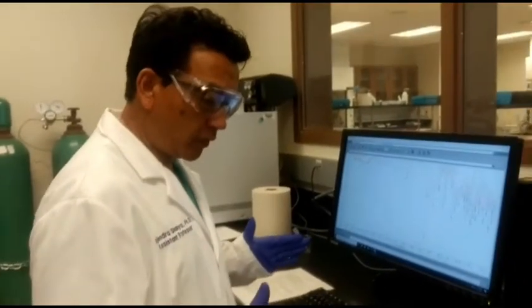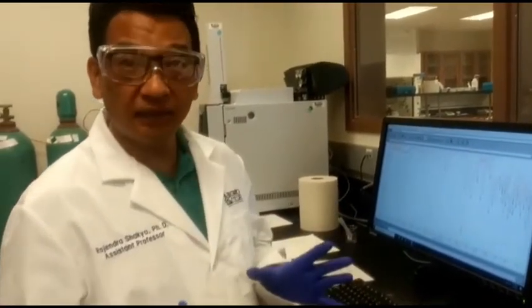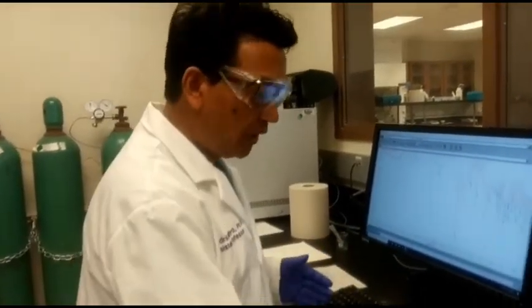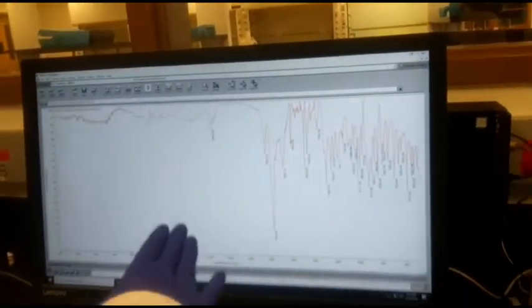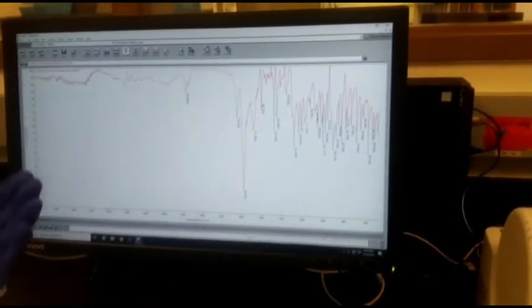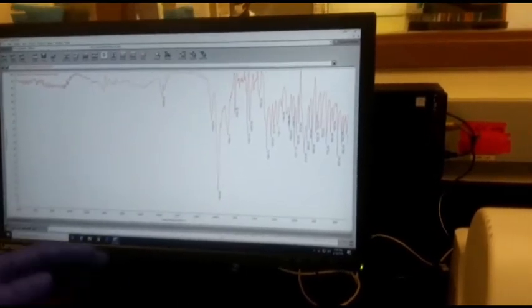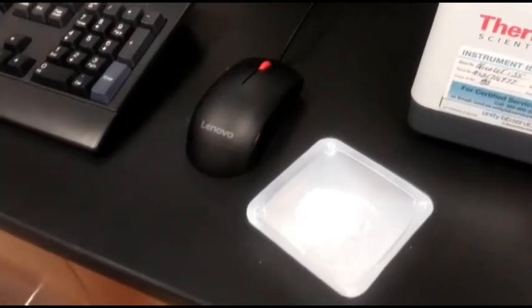Okay? Now here we are for the IR of the starting salicylic acid and the product, this acetylsalicylic acid, so that we can make the comparison. So here is the IR of the starting material salicylic acid, and you need to label the key peaks from this starting material. Again, I will upload the printout of this in your D12 so that you can characterize the important peaks, and we will have now the IR of this product so that you will make the comparison of the peaks on the starting material and the product.